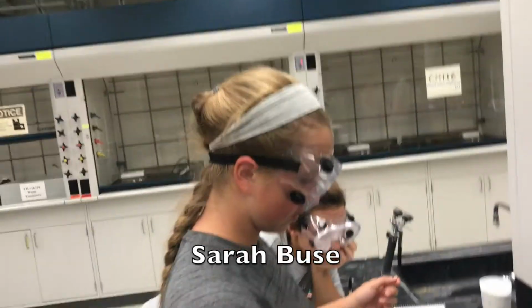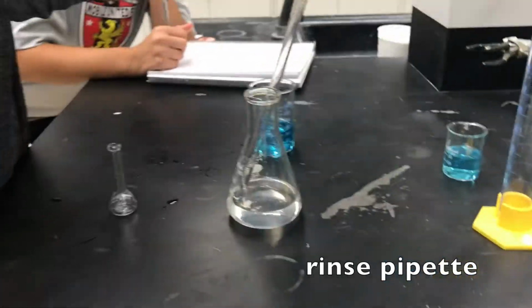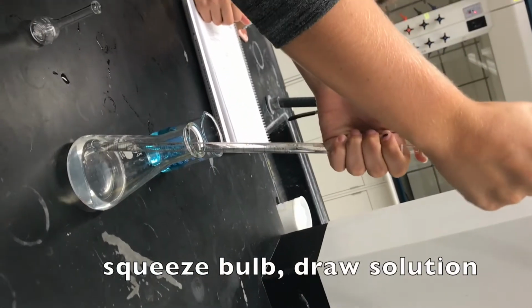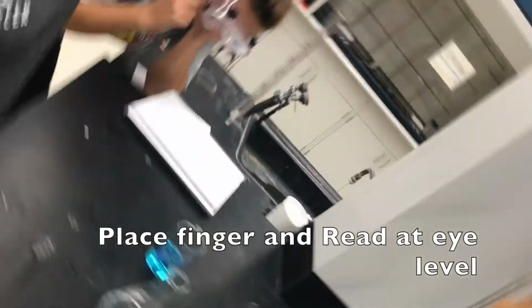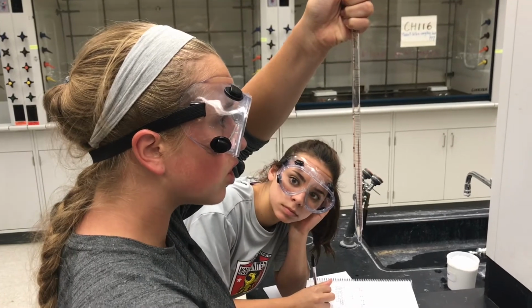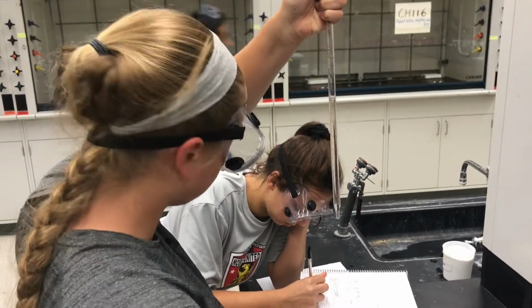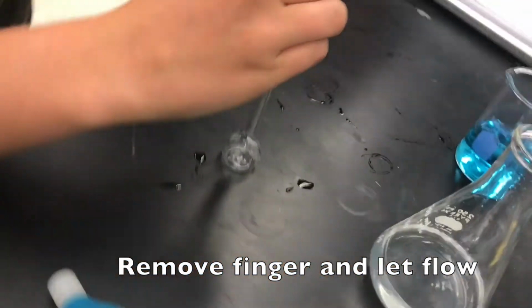So let's recap. After rinsing your pipette, place the bulb on top of the pipette and draw your solution. Place your finger over top and read at eye level. Then remove your finger and let some flow into the volumetric flask.